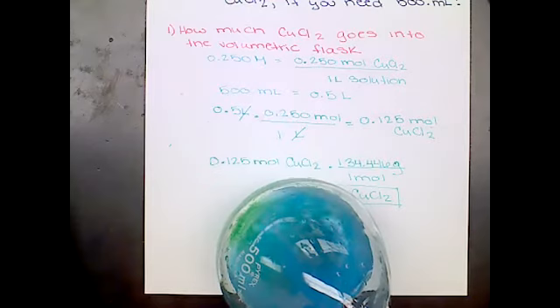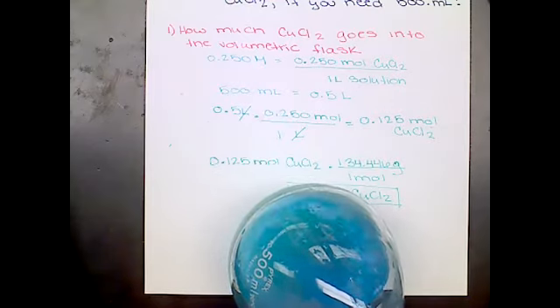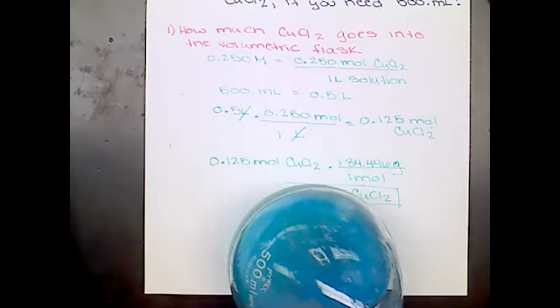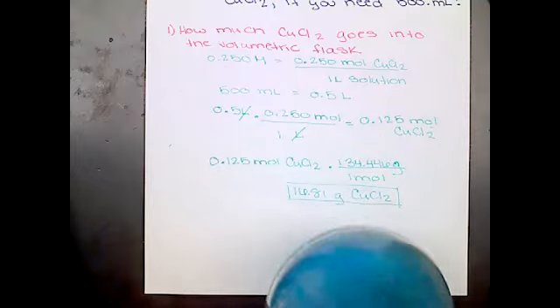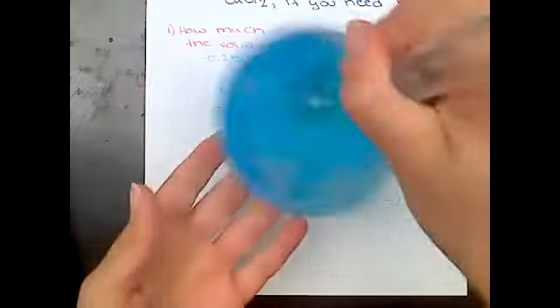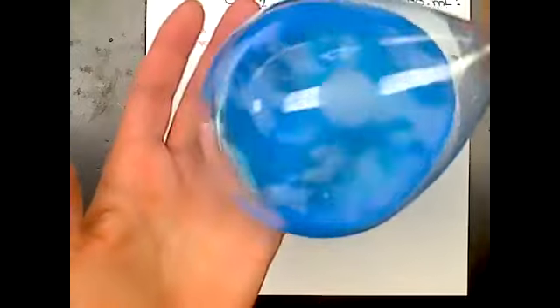And again, you don't want to fill it up too much because you want to be able to shake it around enough that you actually dissolve everything that was solid that you put in there. So I'm going to stop just for a minute. So here it is. You can see that it's definitely not full, but I'm going to shake, move around, and swirl it and shake it up. I want to try to get it all dissolved. I want no more little floating solids. And actually, that looks like that might have done it.